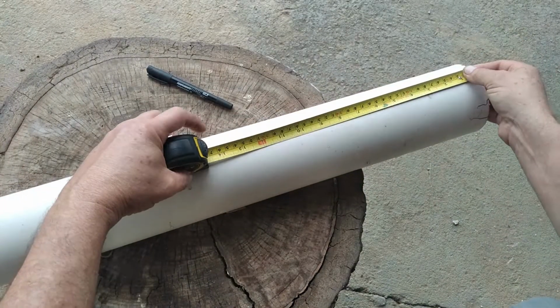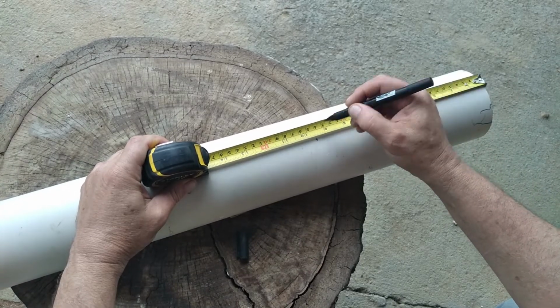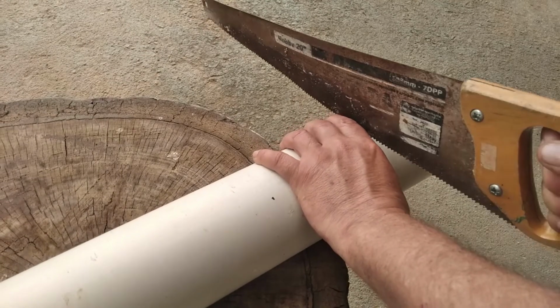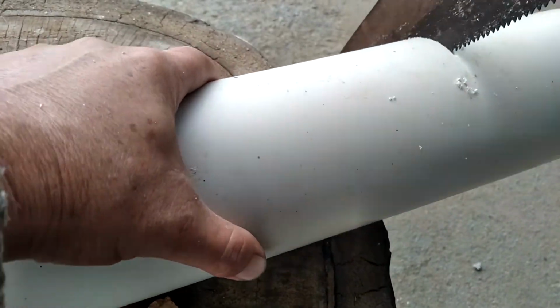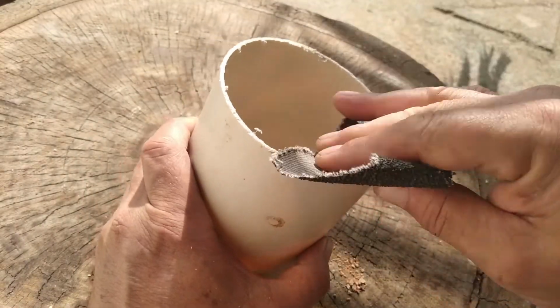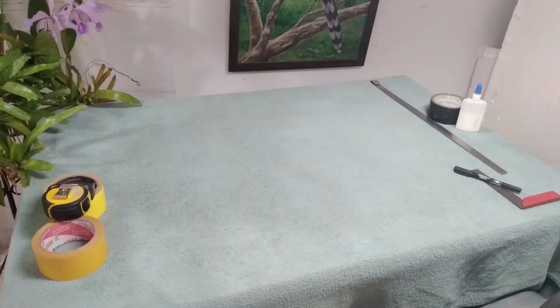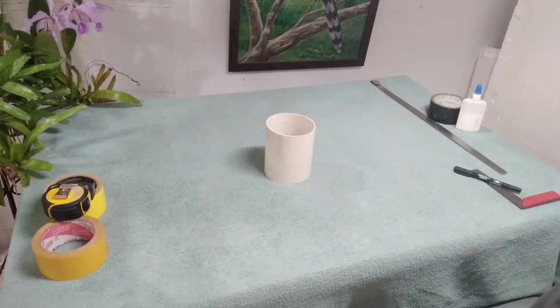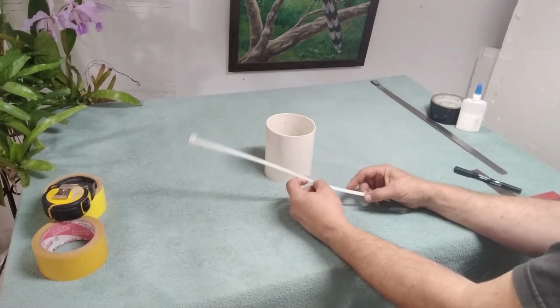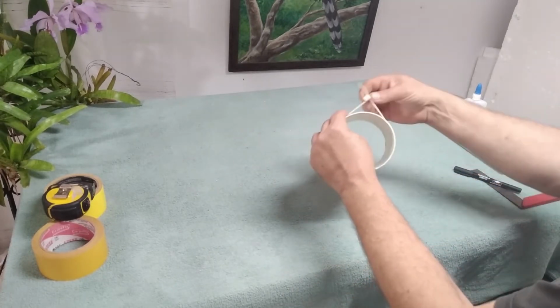Now, remember that piece of PVC water pipe we used before? Well, let's cut two pieces, each 12 centimeters or 5 inches long. It is very important to sand and smooth out the rims. You also need two of these ties. I know them as Hellerman cable ties. They must be at least 40 centimeters or 16 inches long, so they wrap around the PVC pipe.